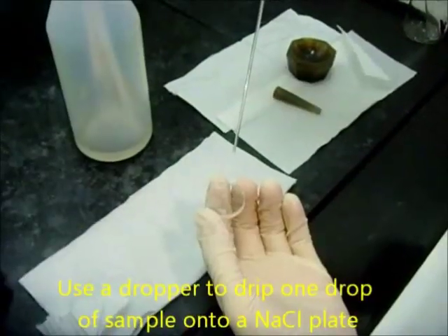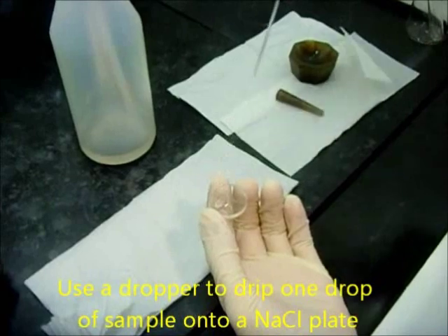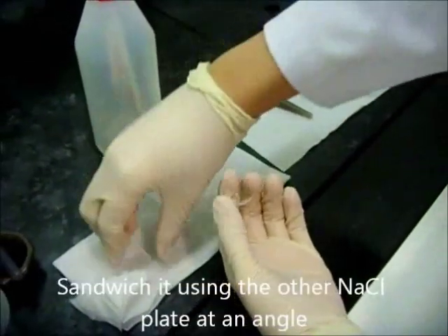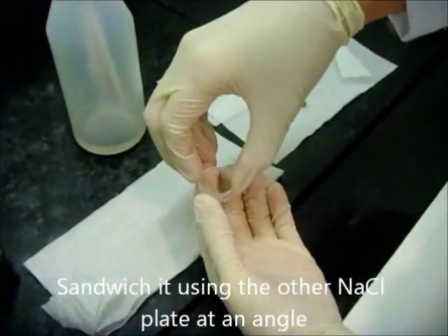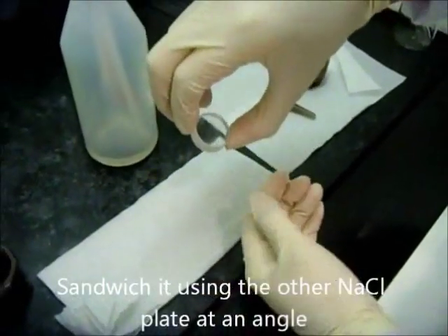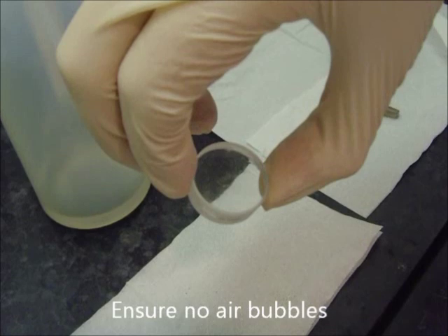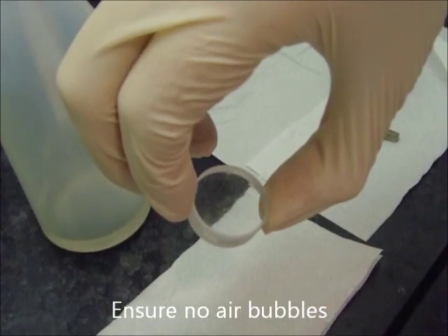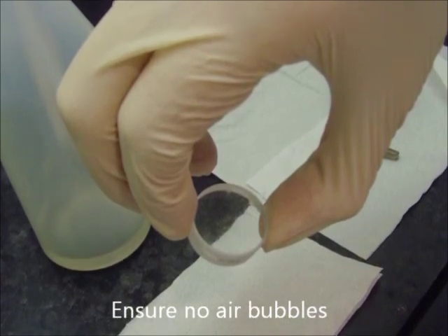Use the dropper to drip one drop of sample onto an NaCl plate, and then sandwich it using the other NaCl plate at an angle, and slowly allow a film to be formed between the two plates. It is very important that there should be no bubbles in between your sandwich — if not, gases such as CO2 or water vapour will show peaks in your spectrum.